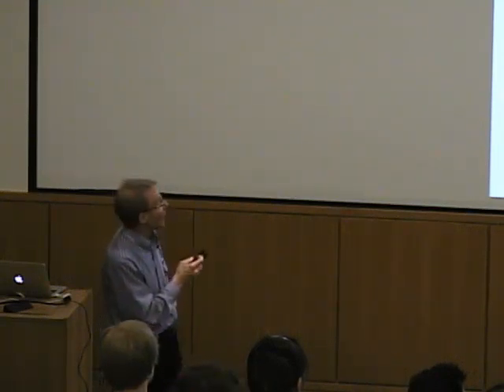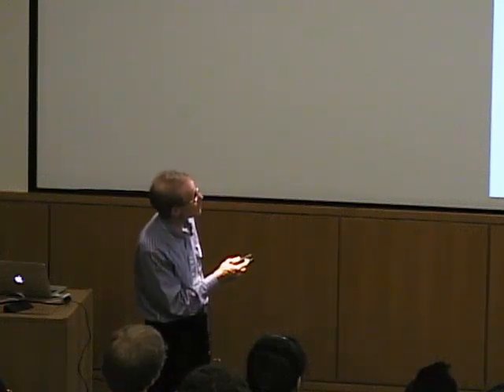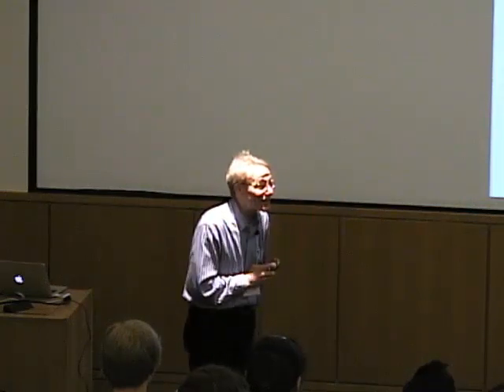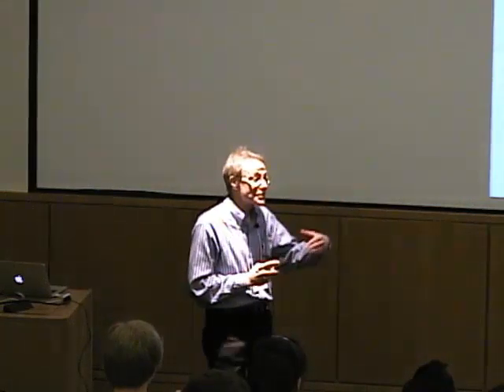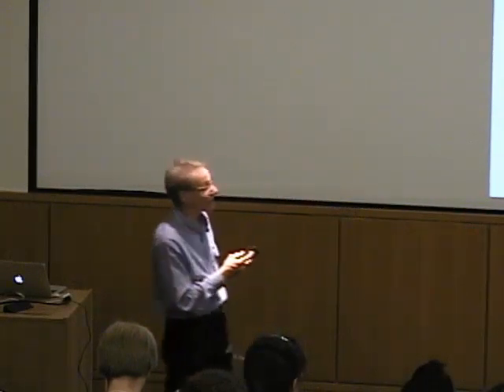Okay. Now, let's look at the thermodynamics. Enthalpy, +2. Wait, that's endothermic. What's going on here? Well, look at the entropy, -23. Copper-2 binding to azurin is entropically driven. Enthalpically, it's not a very happy copper ion binding to that site. Okay? Remember also, there's an enthalpy that goes into deprotonating that active site. You have the enthalpy of deprotonating the thiol and that imidazole.